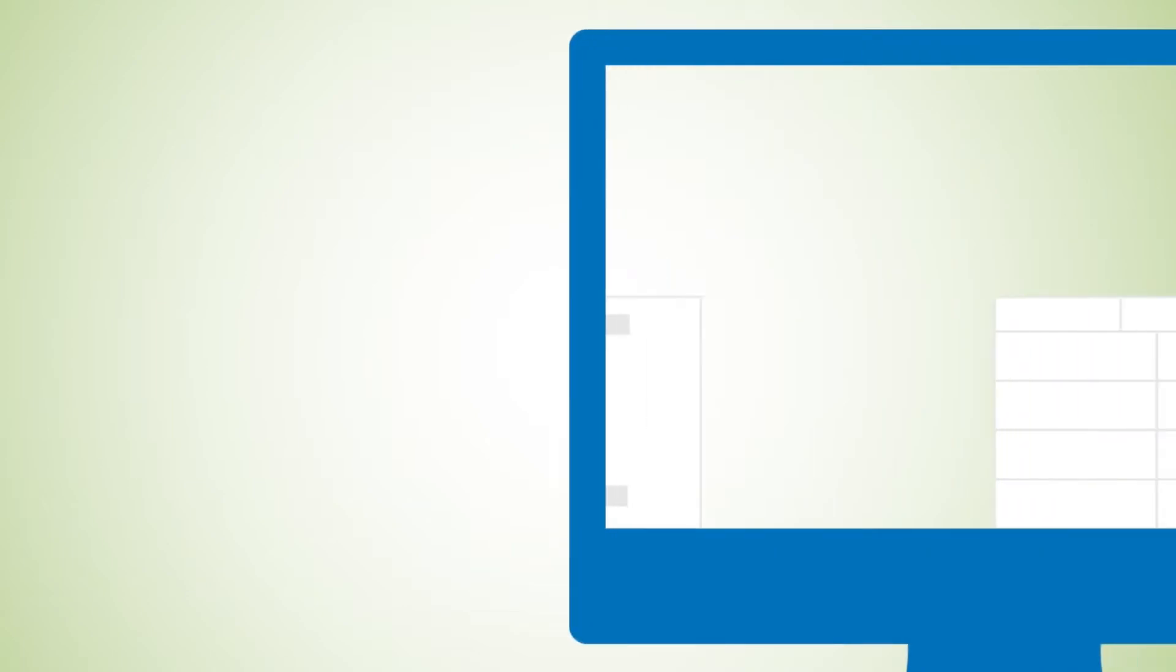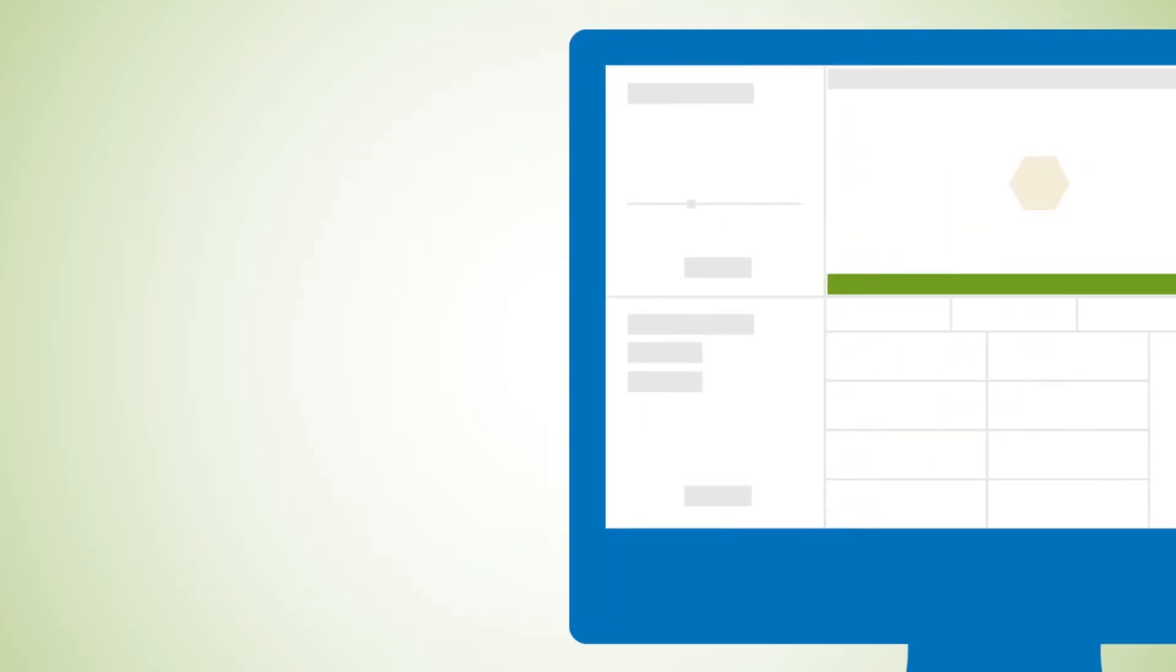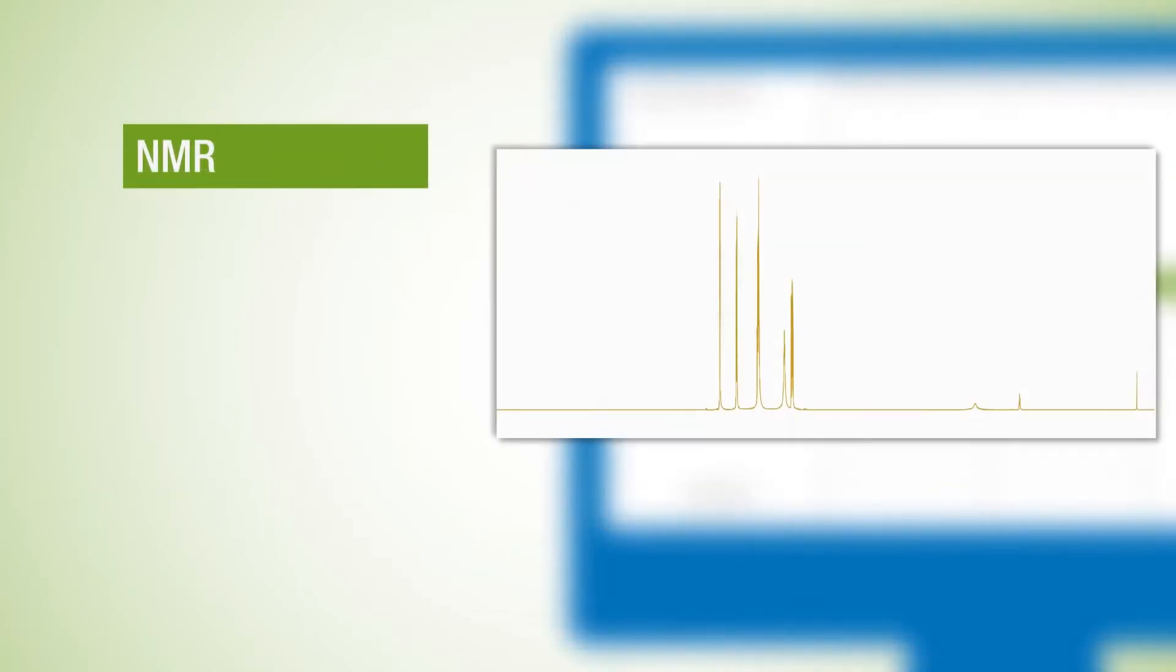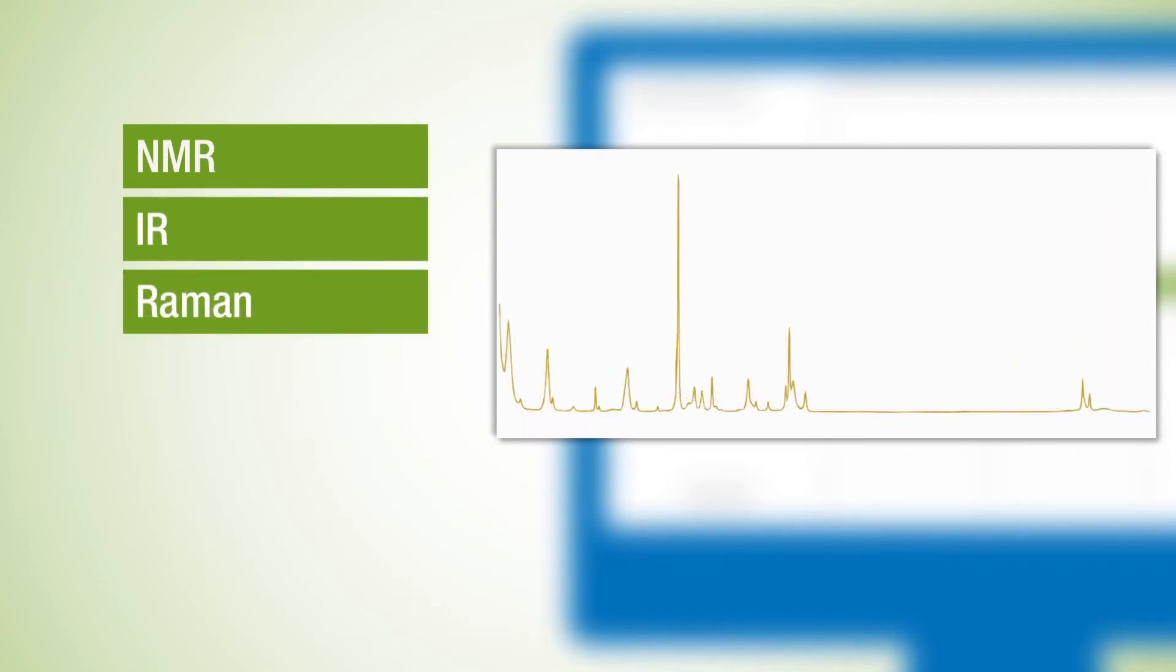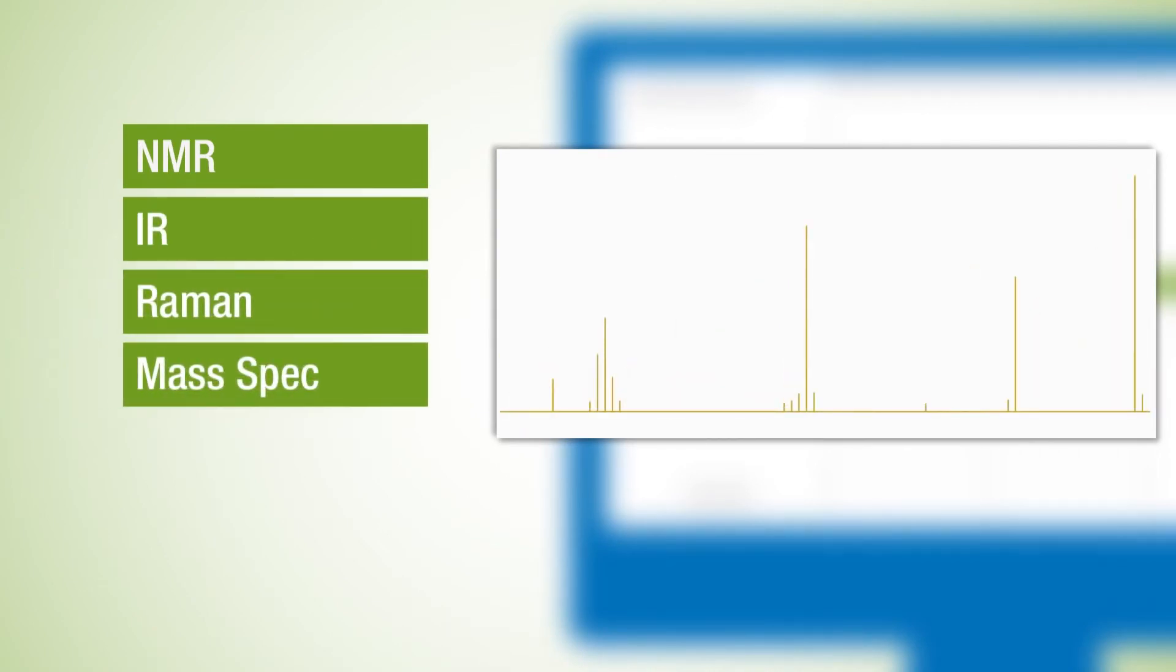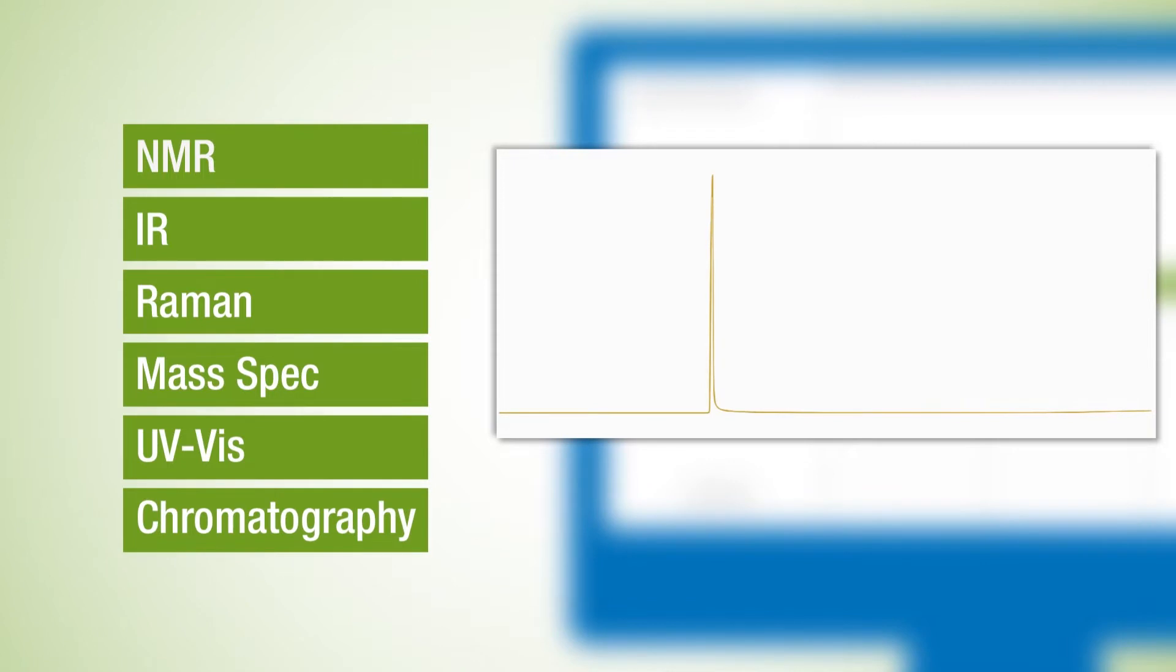It supports multiple instrument vendor file formats and techniques, including NMR, IR, Raman, MassSpec, UV-Vis, and chromatography.